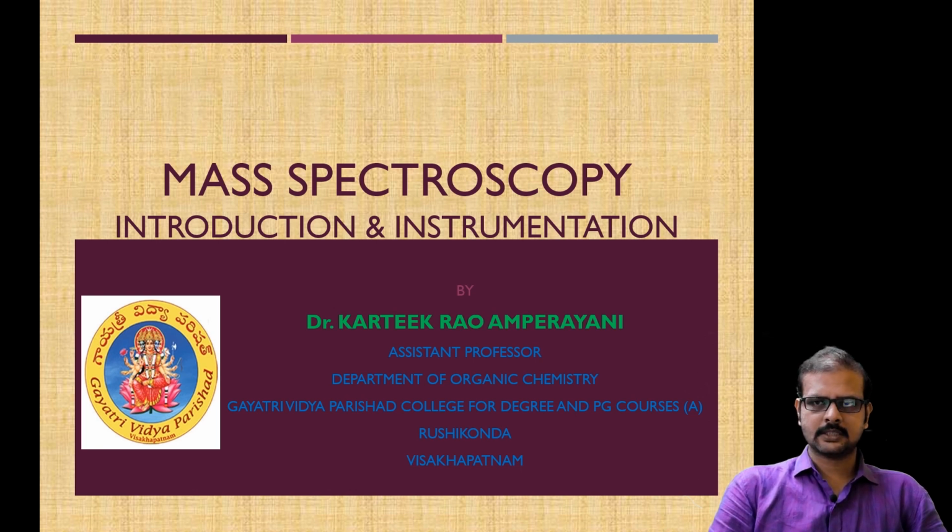As we all know, we need to get the structure in order to identify its properties. We have to first find out the structure of the compound. In order to get the structure of a compound, it is very essential to know the mass of the molecule.